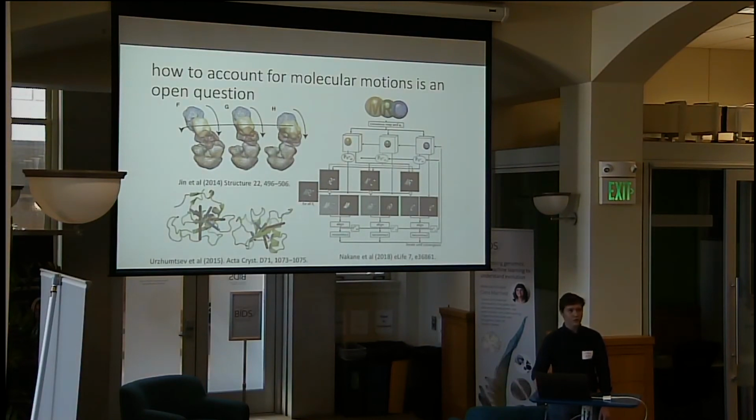So then there's also focused classification, where you would align everything based on the horse's body, and then you would align again based on another part, and you might get this really good high-resolution image of a horse's hoof, but you still don't know how that relates to the body. And so most of the techniques that we've been able to develop until now make some assumption at some stage that there's a rigid body that moves in relation to other rigid bodies.